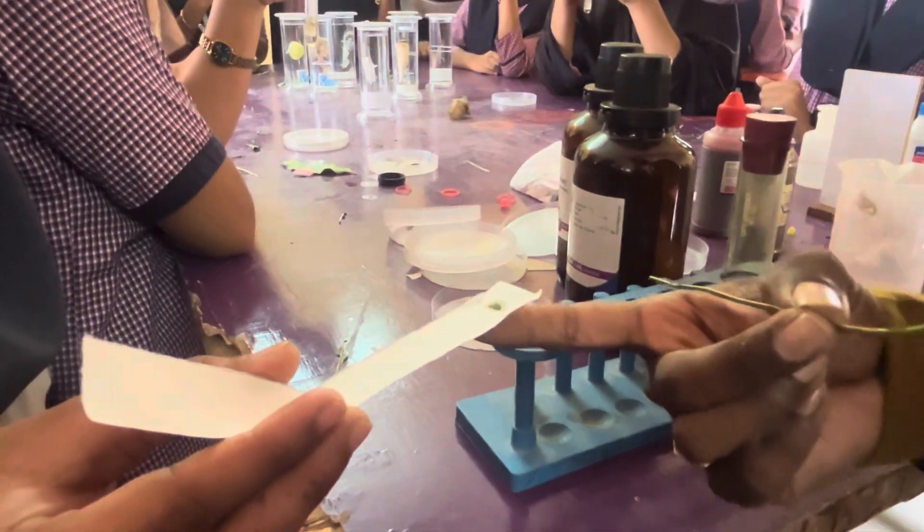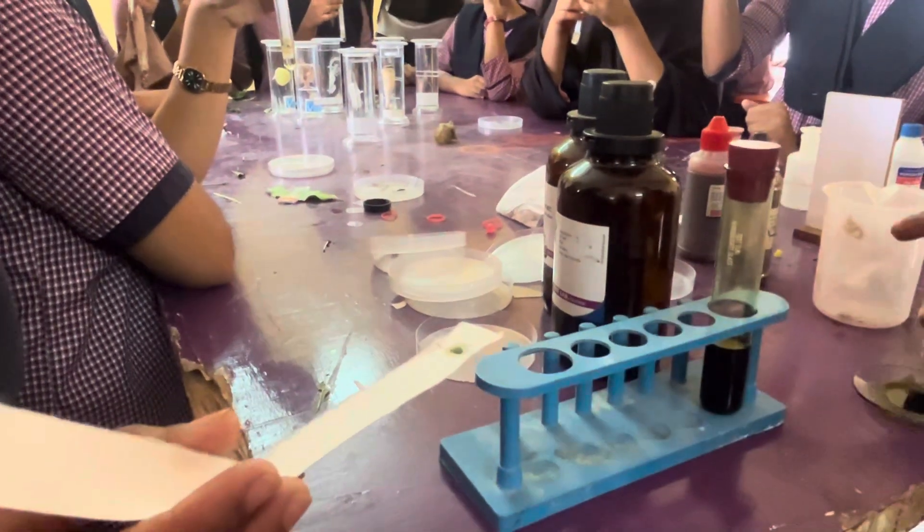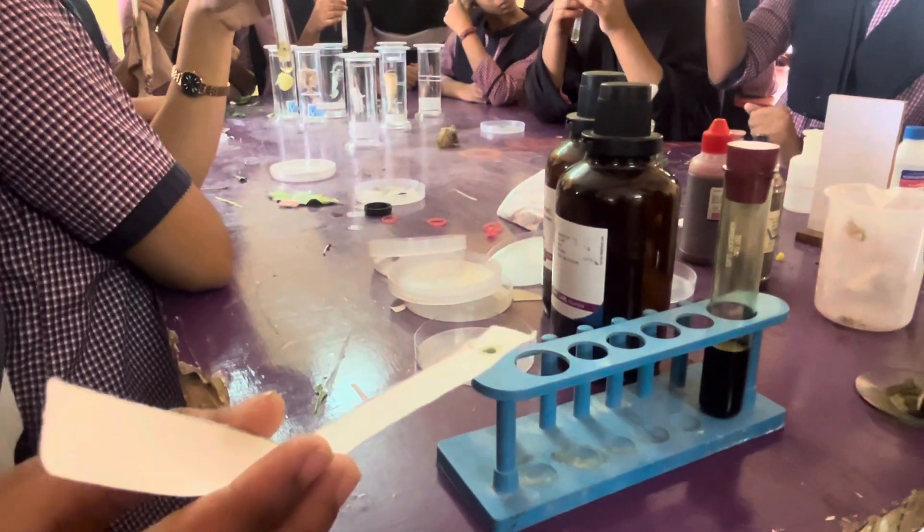We have to make it dry. Then one more drop I am going to place.